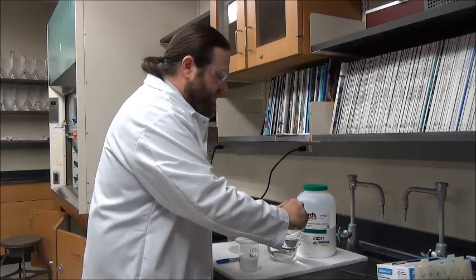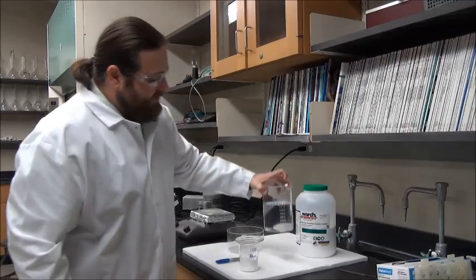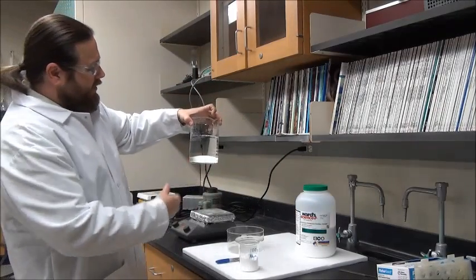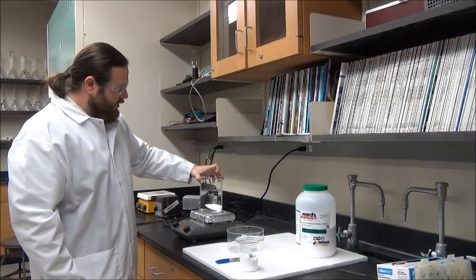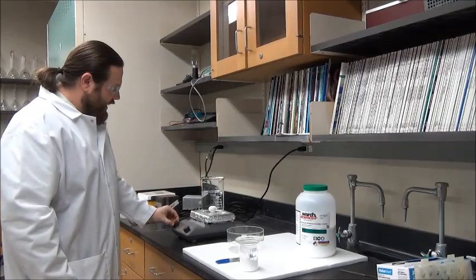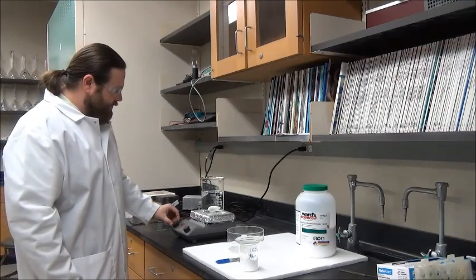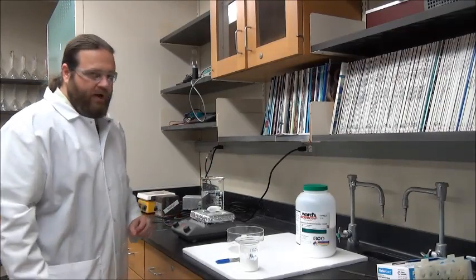We'll go ahead and get this started. The first thing we'll do is add our magnetic stir bar to our water. Here we go, 700 milliliters of distilled water, and I'm going to put that on this hot plate and get this stirring.